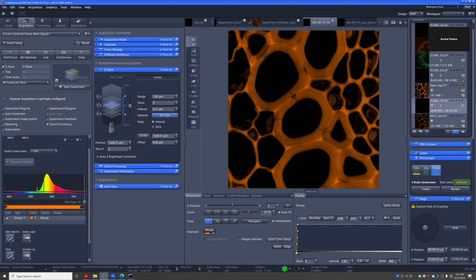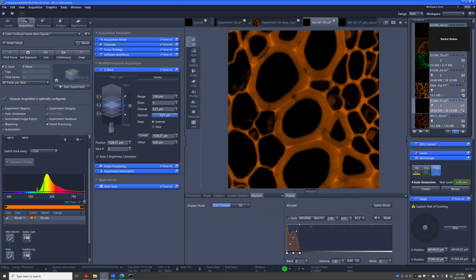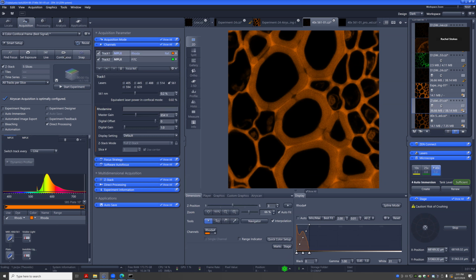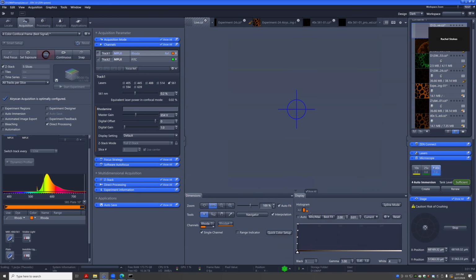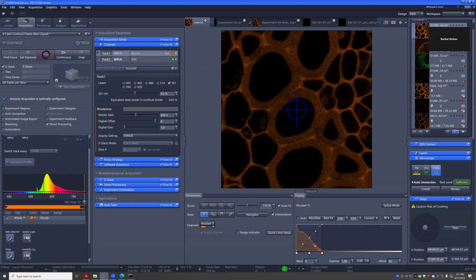The image we're looking at now is a preview image. It's not going to look that different, but if you look at live area scan, for example, if I just go to a live scan, let's see what it looks like here. Let's see if we actually get some signal, because we just switched to the faster mode.